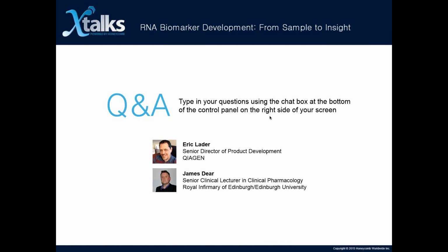This question is for Dr. Lader. Have you compared these PCR-based microRNA profiling results to sequencing-based microRNA profiling on the same starting RNAs? No, our experience to date in comparing data that we've gotten from NGS and the data that we've gotten from PCR is that they're actually fairly similar to each other. We are using some NGS technologies that are a little more advanced than what's commonly available today, so it's hard to actually relate them to each other.